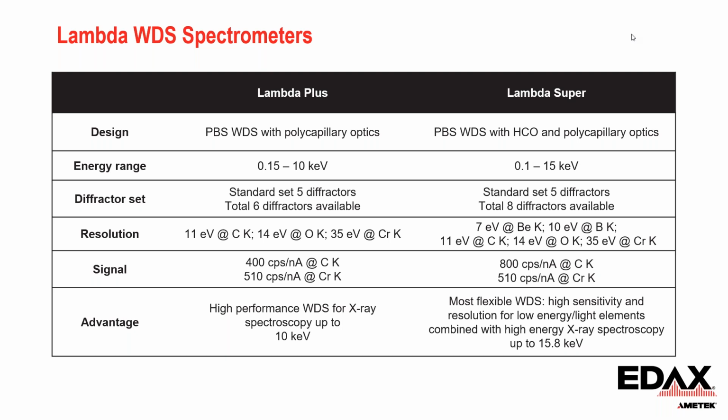The Lambda Plus has 5 diffractors to choose from, and the Lambda Super has more diffractor options, a total of 8 diffractors.